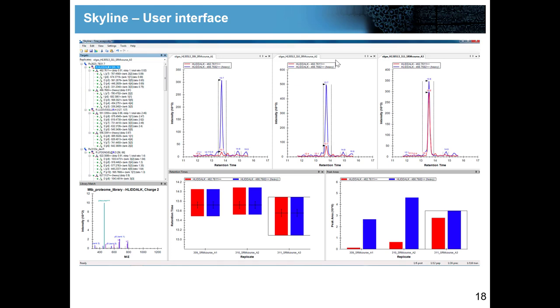This is how Skyline can potentially look like when you load data. Now there is no more gray window and the targets window is populated with information. This target window will always contain your targets of interest. This is where you specify what proteins, peptides, precursors, and transitions I'm interested in. It really has this tree-like structure. On the first level you will always have a protein name, under the protein on the next level you will have the peptide sequences that you want to target for that protein.